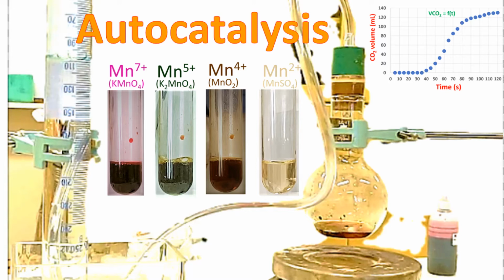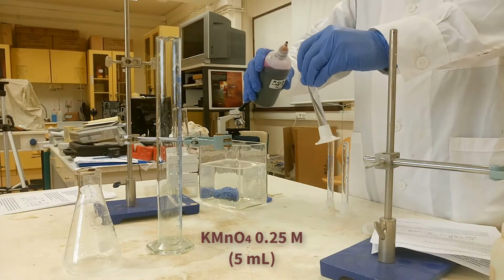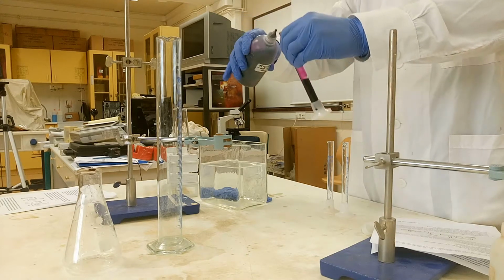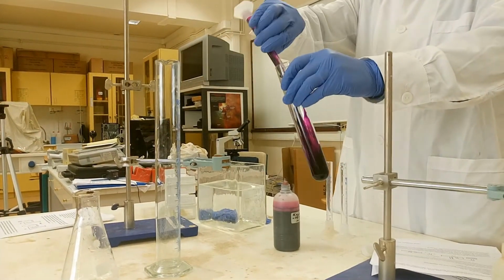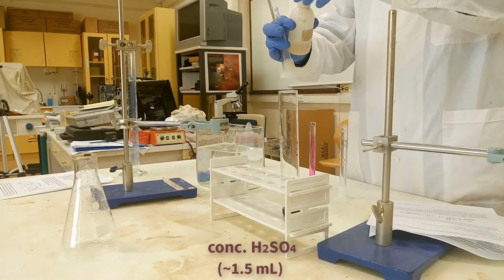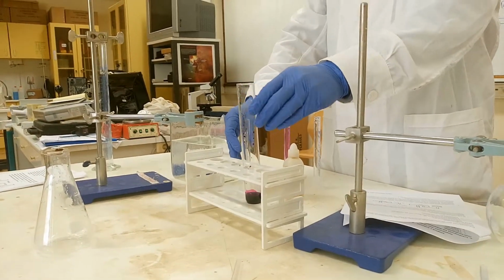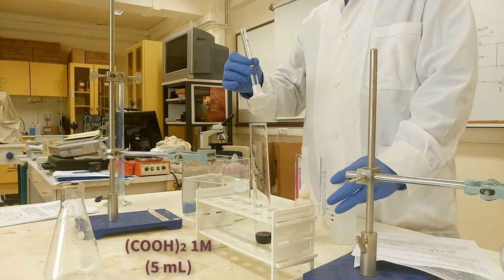In this video, we study a reaction that proceeds through autocatalysis or self-catalysis, which indicates that one of the products acts as a catalyst to the reaction. We mix the indicated amounts of reagents. The limiting reagent is potassium permanganate, so at the end its purple color will be fully decolorized.